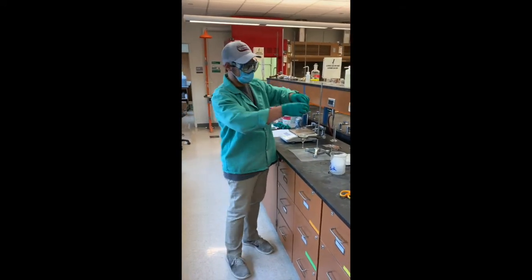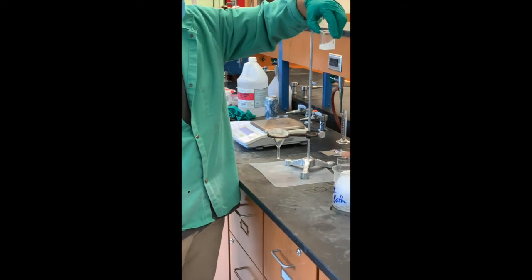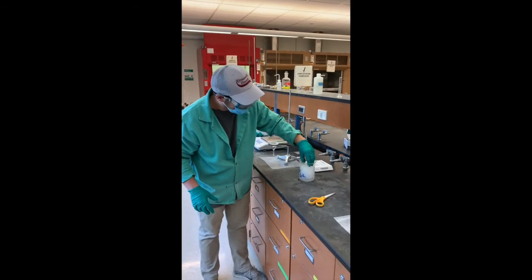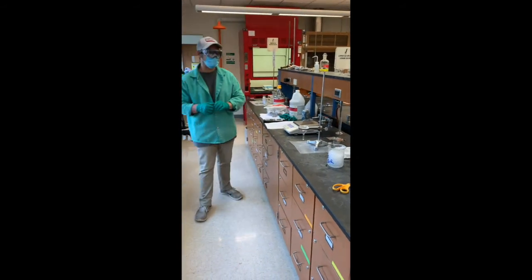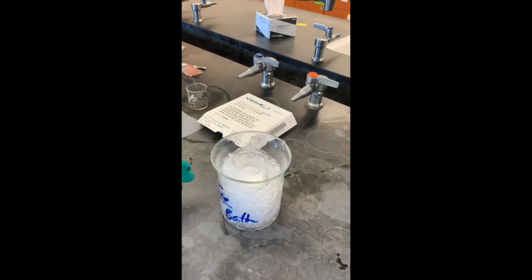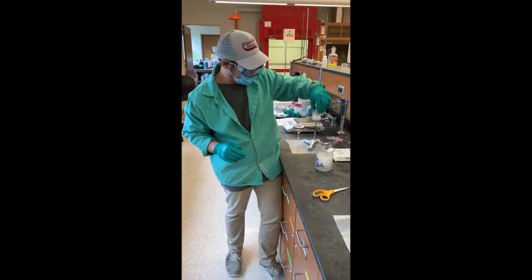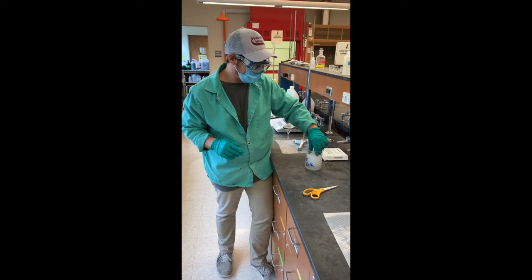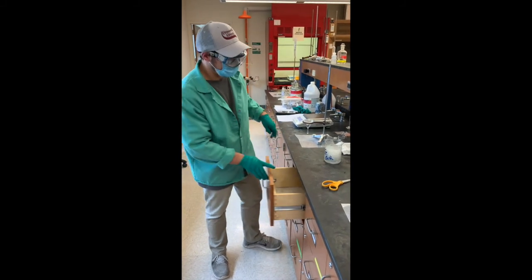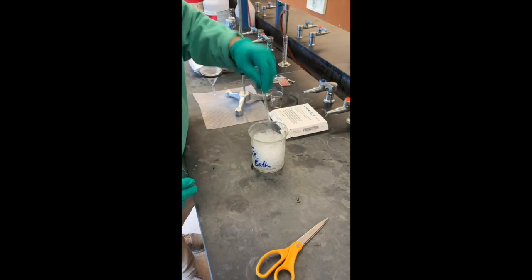Upon adding our sulfuric acid, we will have the formation of our alum. We're going to take our alum and let it sit on ice so we can allow that precipitation to occur. And then we will wash this and any excess. We're going to allow this to cool for about 10 minutes as our alum is prepared. You'll want to mix with a glass stir rod to allow for the formation.